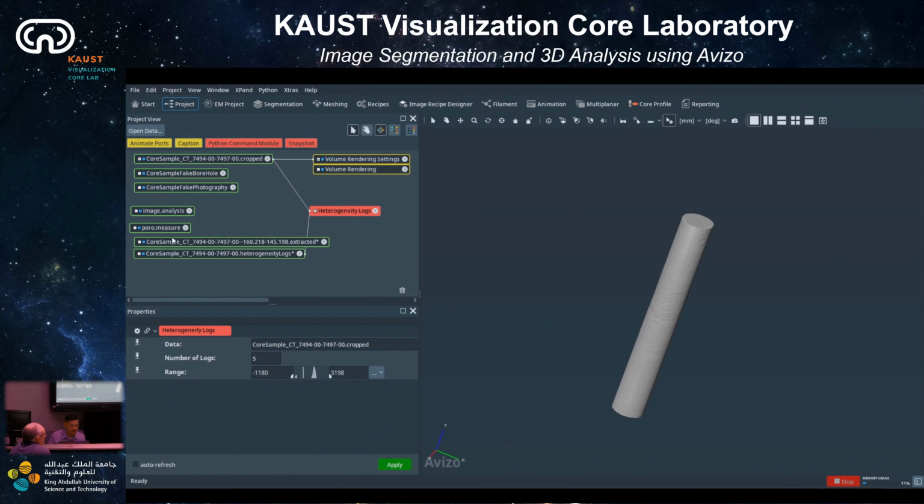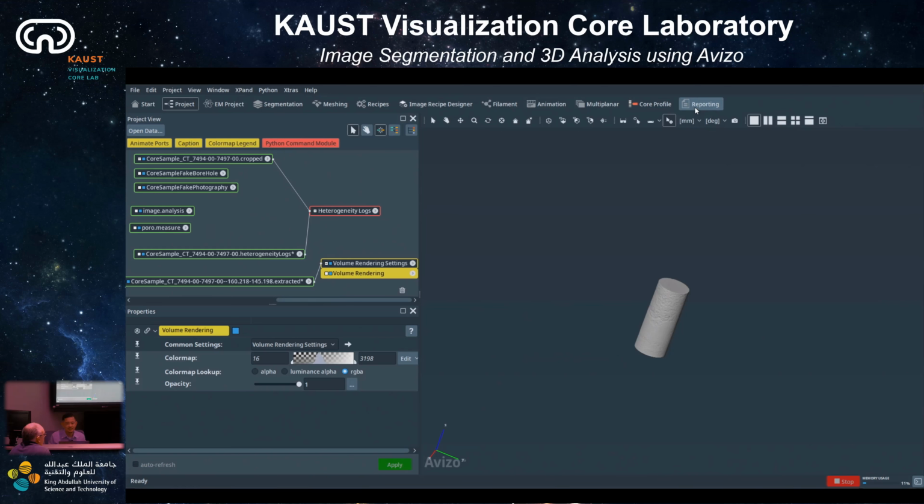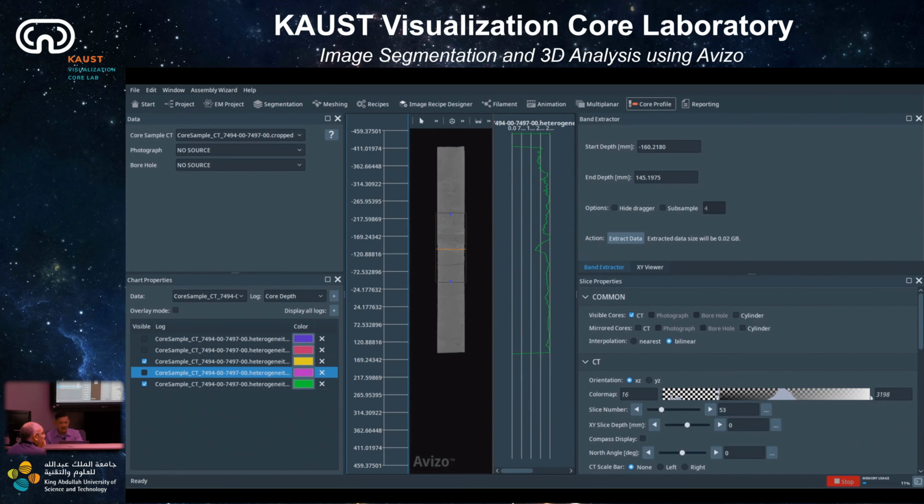So you get the extract here, which is only the shorter part. So this is from the band extractor. Is that okay? It's clear. So you go to profile, you can just select and extract whatever band you just defined with your own value here. You can see the value.